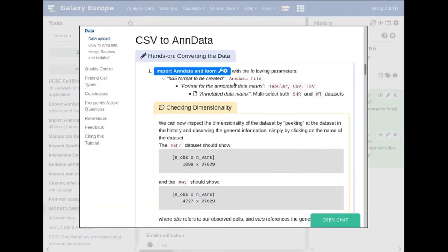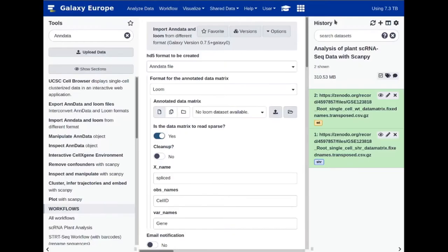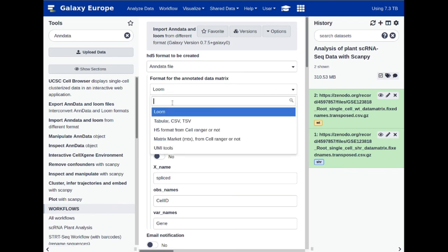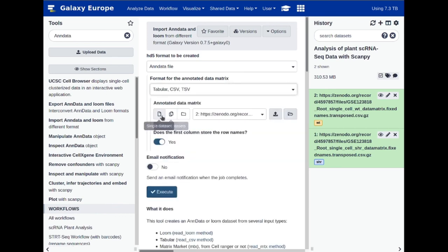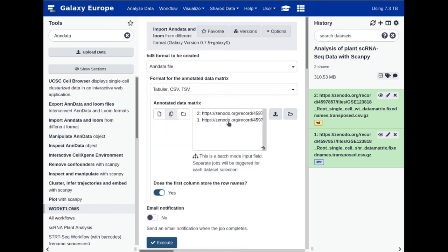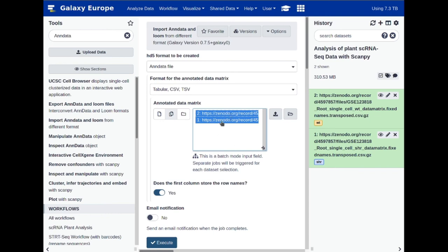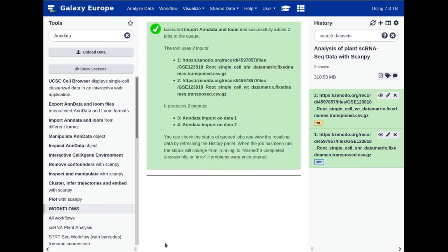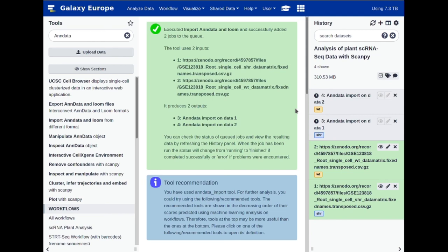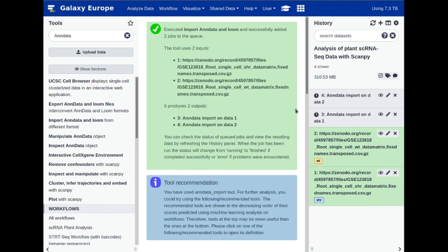Going back to the tutorial, we need to choose our format as the tabular CSV and TSV file. The annotated data matrix input file should include both the SHR and the WT datasets, and I'll show you how to do these in one step. Click on this, select 'Tabular TSV and CSV', then click on 'Multiple Datasets' to select both dataset one and dataset two. You can hold Control to multi-select or Shift to select a range, then hit Execute. We wait for these to become green, which should give us a much more introspectable view of what is happening in these two datasets.